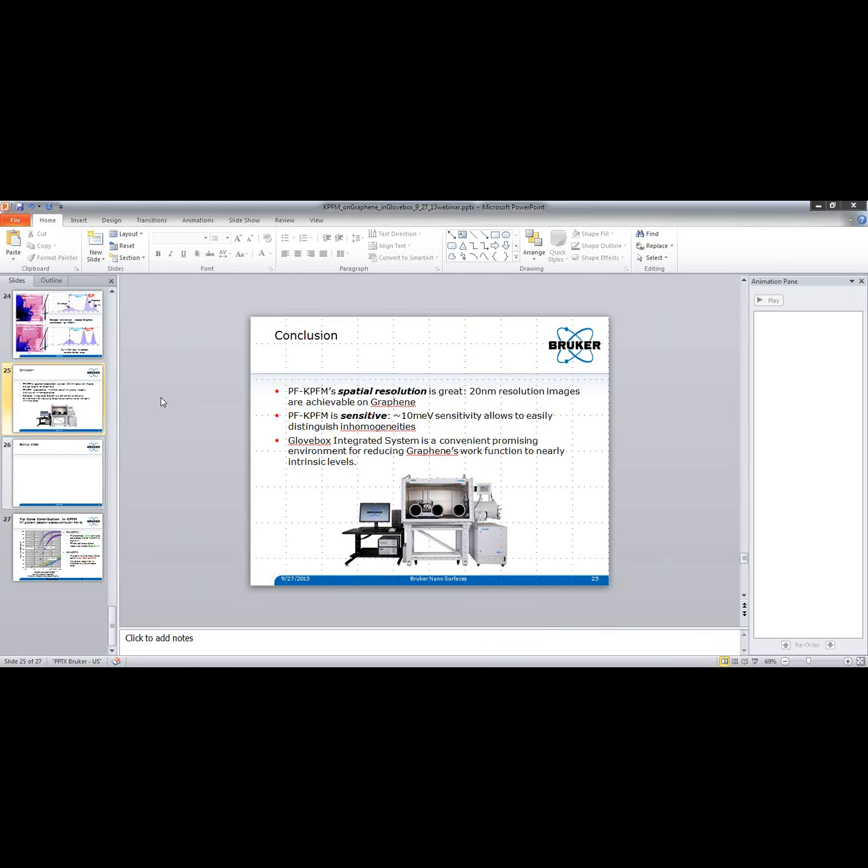Okay, so continuing to move into the experiments a little bit more, maybe a decent transition is there's a couple questions on the preparation and if you used heating, or should you, or would it be interesting to use heating or any sort of annealing to further remove or absorb water? Yeah, that's an excellent question. We did not use any heating, but that is something that we would like to try and see how much difference it makes. But basically, the sample was just measured as prepared.